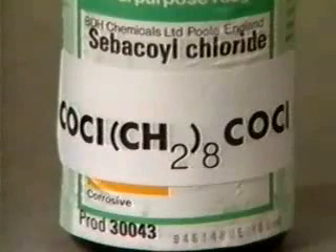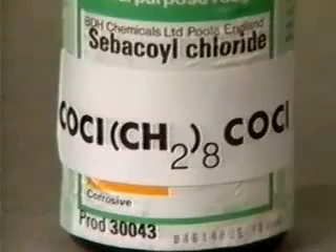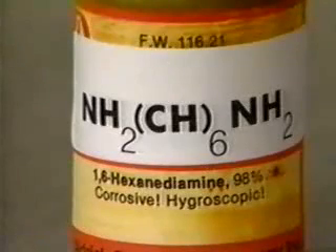In this experiment, some sebacoyl chloride, or more formally, decan-dioyl chloride, will be reacted with a diamine, 1,6-hexane diamine, or to give it its formal name, 1,6-diaminohexane.